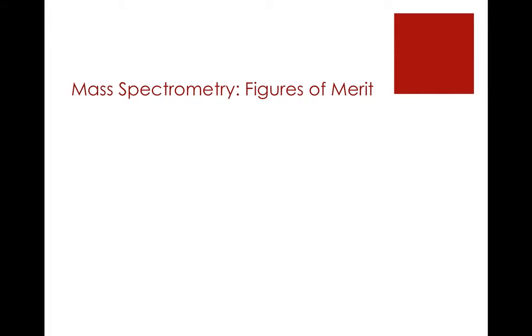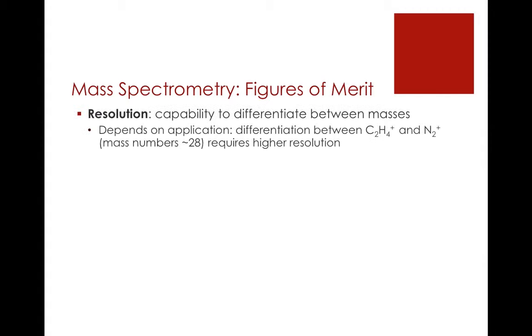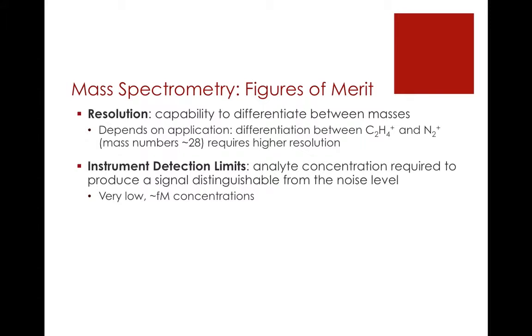Next, we'll talk about mass spec figures of merit. Resolution is the capability to differentiate between masses. This quality depends on application. For example, differentiation between two ions with the same mass numbers requires higher resolution.